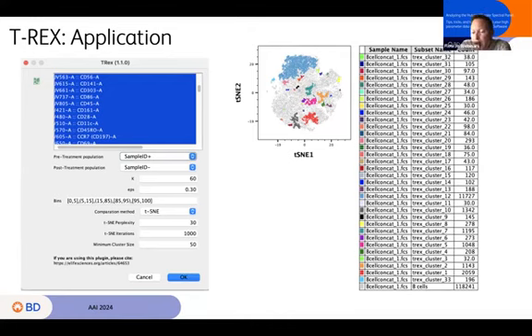If you're actually looking for more subtle differences within a type of cell, do I get variance in the particular flavor of that kind of cell? Or am I getting more functional differentiation within a type of cell? Then perhaps it's nice to throw, after your QC, one more gate on your data. Give me the B cells, or give me the T cells, or something that you can identify with a really strongly bimodal population in a single gate, for example.